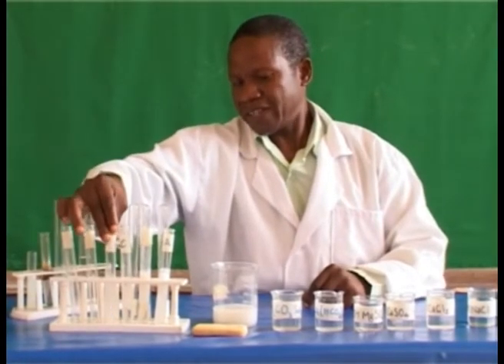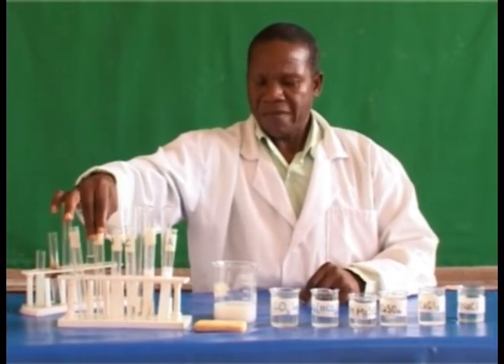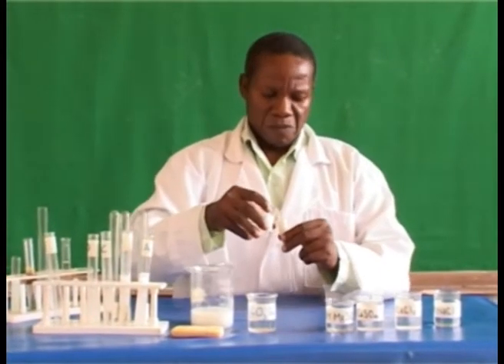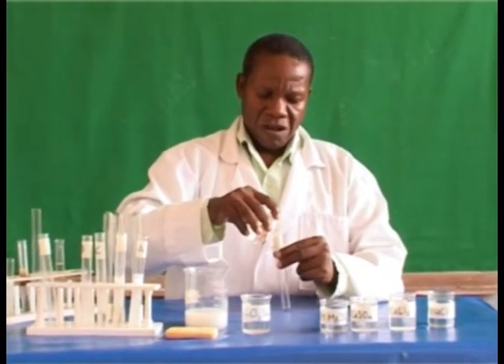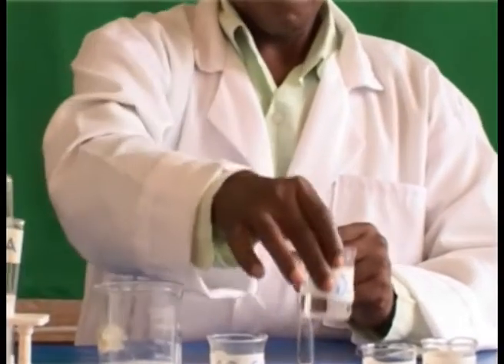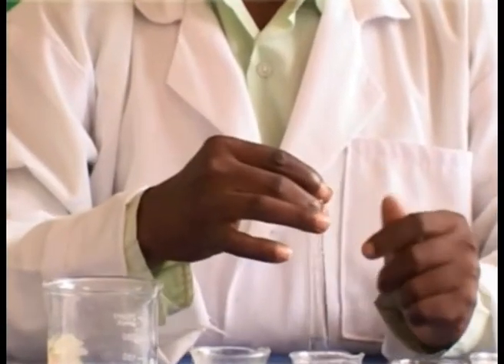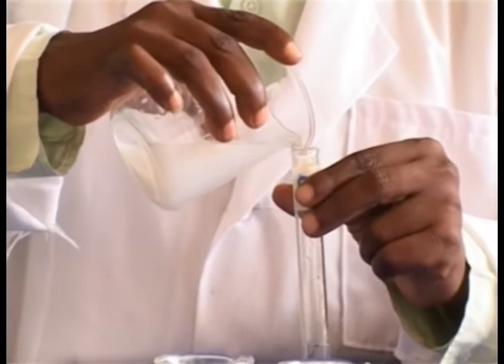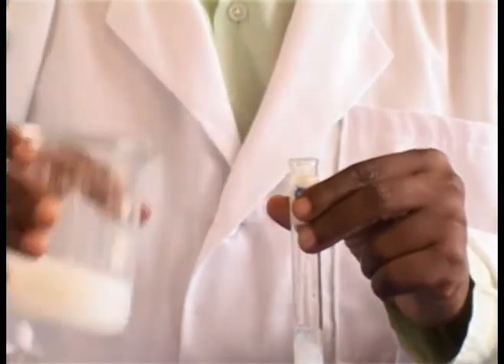Let us put it in the test tube rack to check. Then this is test tube E. Let us put calcium hydrogen carbonate solution, followed by the prepared soap solution, and then shake.